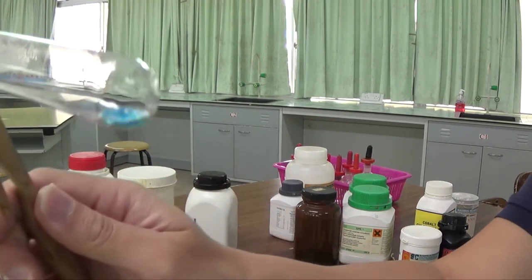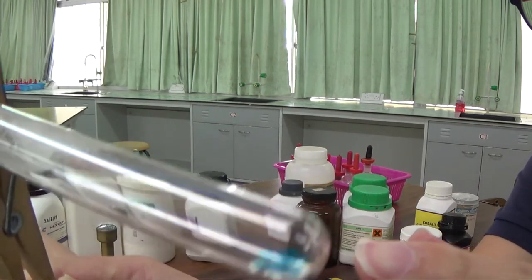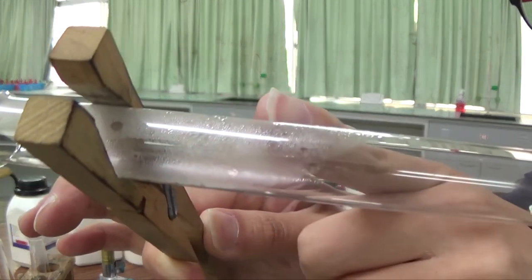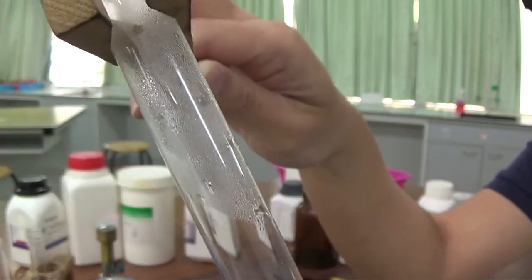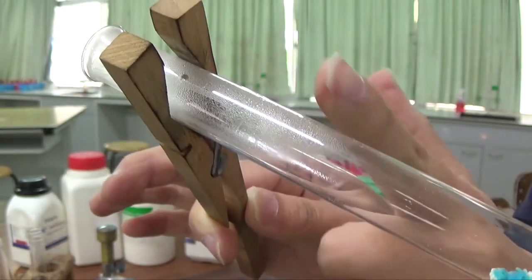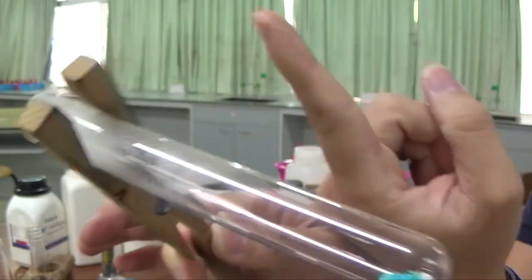Just bring attention to this. You could see that the blue solid has slowly turned white, so there's a bit of white solid now, and then there is a condensation, and this condensation is not colored, it's not blue in color. As you could see, it is a colorless liquid. These are liquid, these are not gas, because they condense on the upper part of the tube. I touch it outside and it doesn't do anything because the liquid is actually inside.